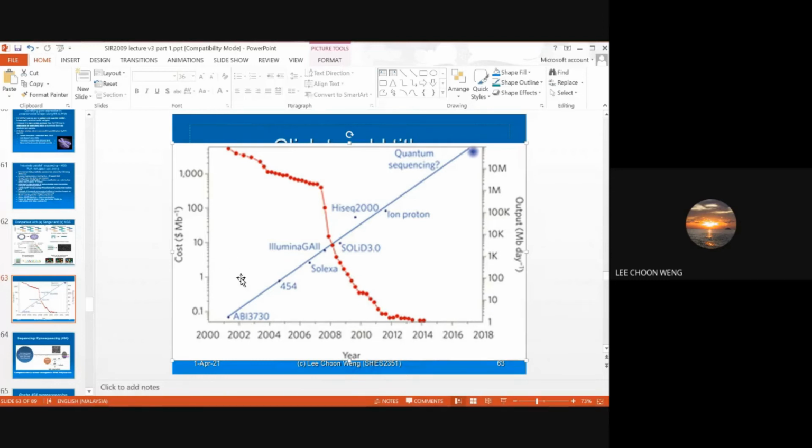Okay, so there is an enormous amount of data, which can easily overwhelm a lot of computing systems. But the problem with so much data is that there are error rates.